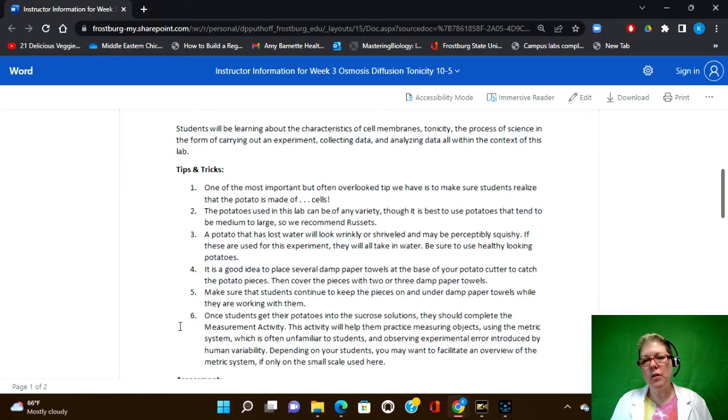If you use the test tubes without a top, you're going to have the students use something like parafilm to seal the tubes. And almost none of them, if any of them, have used parafilm before. It's incredibly uncommon to have that happen. So you might need to show them how to use parafilm, which is fun in itself.